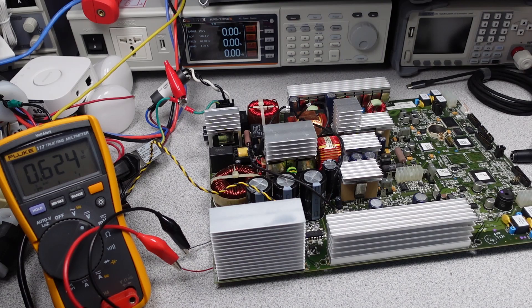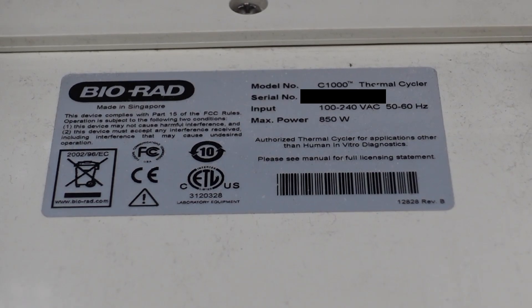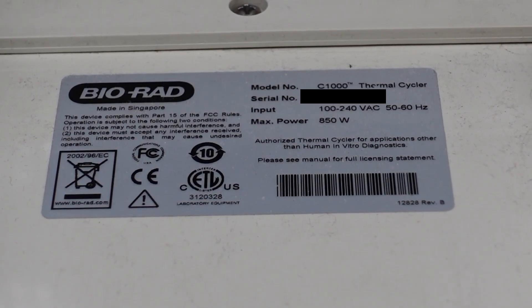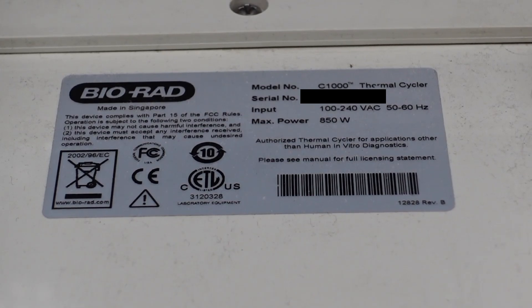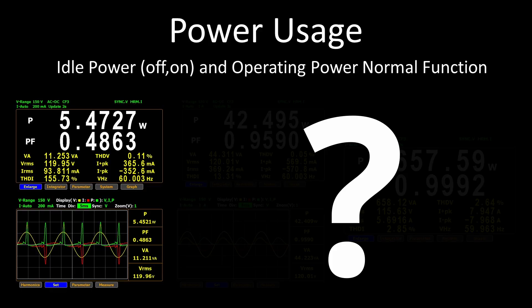While the machine is apparently running, the power supply is failing to start properly. Looking at the power analyzer and the power input side, the unit has an operating plate stating it can use 800 watts of power when processing samples. This is a fairly substantial power supply. The idle power consumption when plugged in with the switch off is about 5 watts of power. This is pretty bad — a lot of electronics stay powered up inside this machine even when it is doing nothing. The CPU isn't booted up, so this is just burning 5 watts doing nothing.